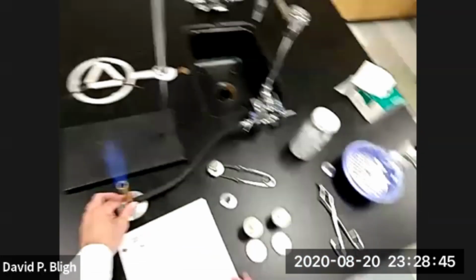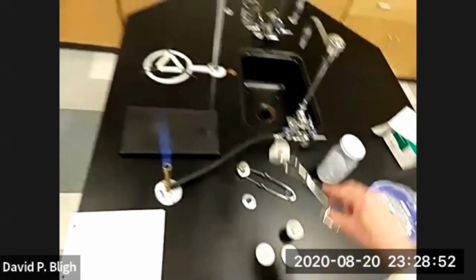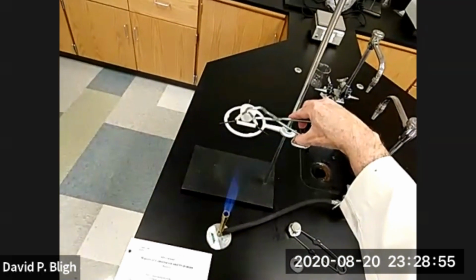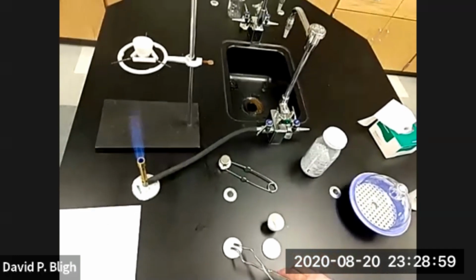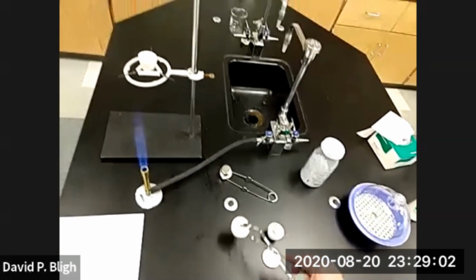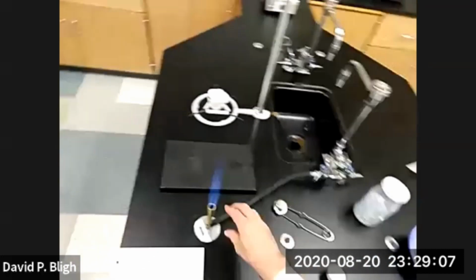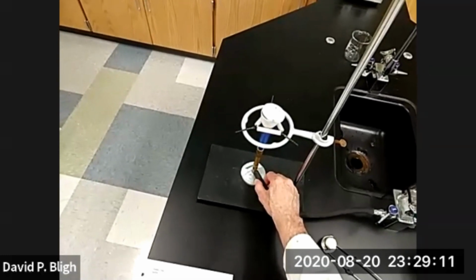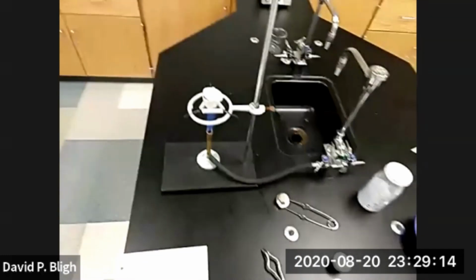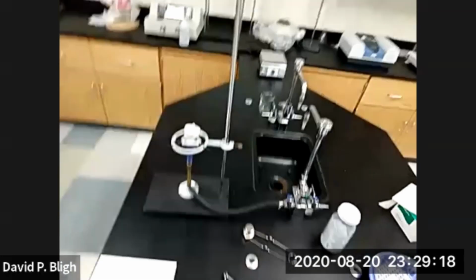There we go. Okay. So the method says heat for 5 minutes. Put the crucible in there. Put the lid on it with just a little bit of space for any moisture to escape. So we put it on like that. Then we put the flame under it, and that's pretty well adjusted. The hottest part of the flame is right under the crucible, right? So 5 minutes, 11:35, we'll be done with that one.